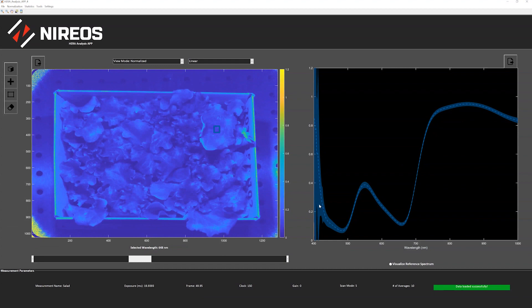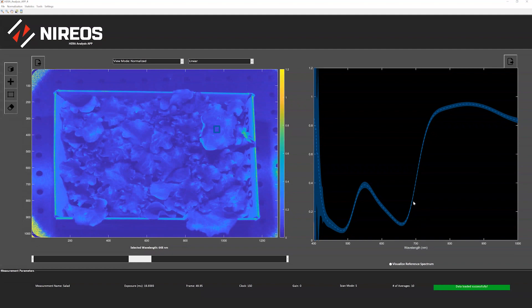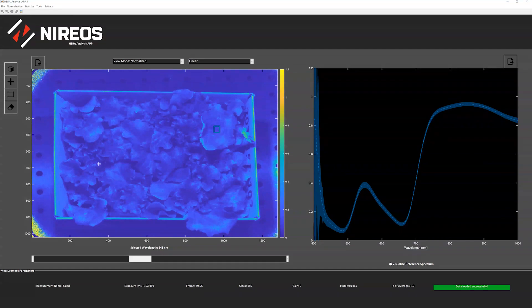If we now choose a portion on the image, we can see that the spectrum now is in reflectance. So this is the typical reflectance spectrum of a leaf, a green leaf. You can see here the visible part and at 650 to 680 nanometers, this is the typical absorption feature of the chlorophylls.